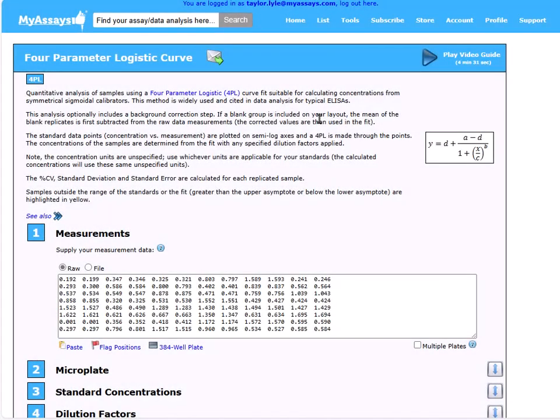In this video, I'll demonstrate how to validate the curve fitting functionality performed in myassays.com with Excel. We'll validate the analysis performed in the myassays.com assay by reproducing the analysis independently of the online myassays.com service in Excel. The intention is to provide transparency in the methods used, which is useful for comparison and validation purposes as might be required for customer quality requirements.